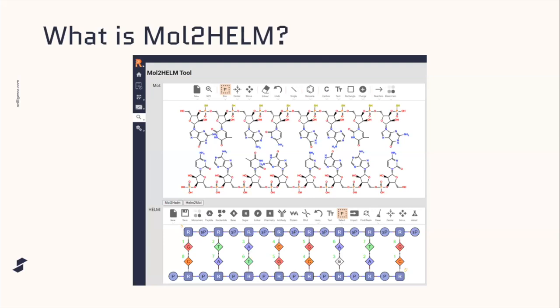So you can see the small molecule representation does not have any pairing information. And when I've converted to HELM notation, I've been able to just use the Scilligence auto pairing tool to auto pair even with some non-conventional nucleotides like inosine.